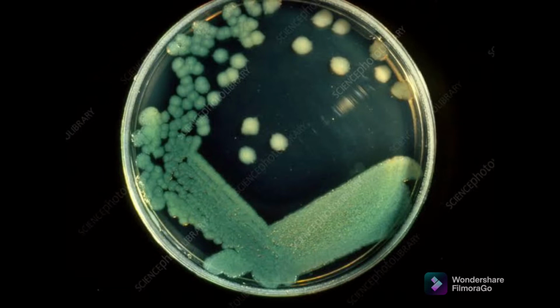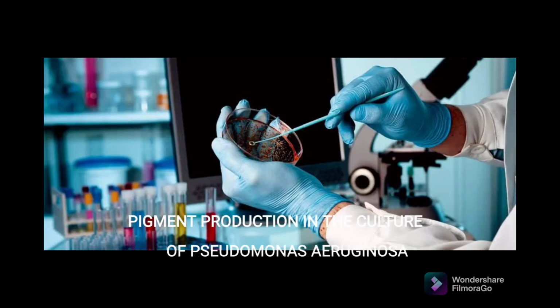In a MacConkey agar medium or slant, the colonies of Pseudomonas aeruginosa are colorless due to the lack of lactose fermentation, which is of great importance in differentiating P. aeruginosa from other bacteria present in the specimen. Pigment production in the culture of Pseudomonas aeruginosa.